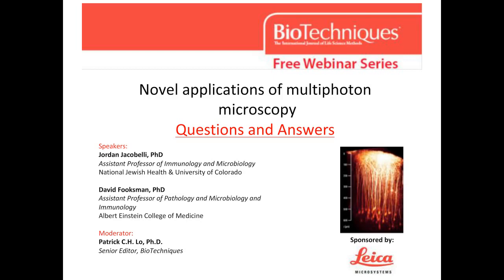Great. The other thing I'd point out is one of the nice features of two-photon imaging is you get the second harmonic generation, which can give you information about collagen or repeated structures. And even with sections, you can get that same information, and that can be very useful, even if you're not doing in vivo imaging. Great, thank you.